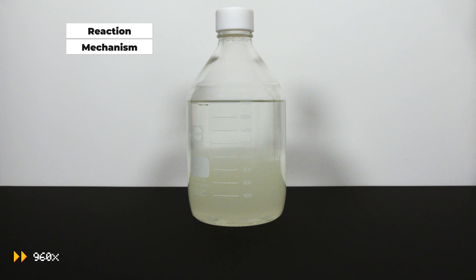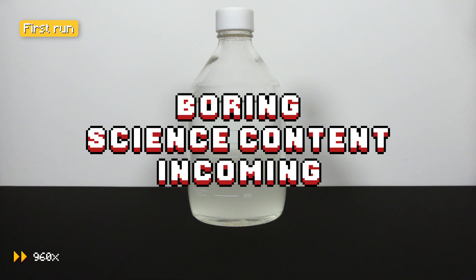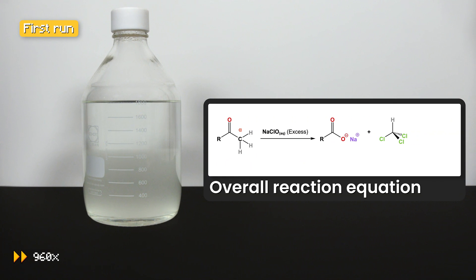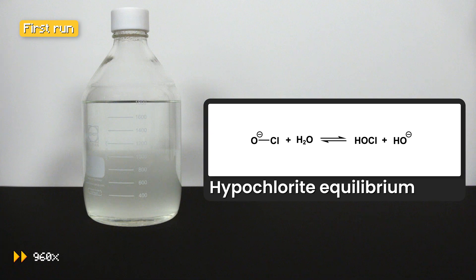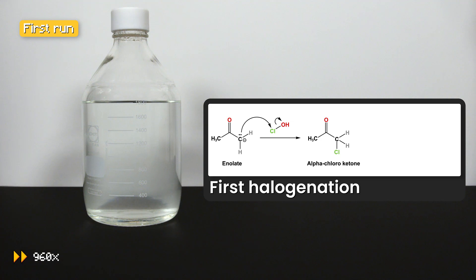Both bottles of mixtures were allowed to react for 24 hours for the reaction to complete. While you watch the 24-hour time lapse, let me explain a little bit about this haloform reaction. The bleach solution dissociates into hypochlorous acid and sodium hydroxide in an equilibrium. The hydroxide ion abstracts a proton on the alpha carbon of the methyl ketone — in our case, acetone — forming a resonance-stabilized enolate ion. The nucleophilic enolate then attacks the chlorine atom and undergoes an SN2 halogenation, forming alpha-chloro ketone.